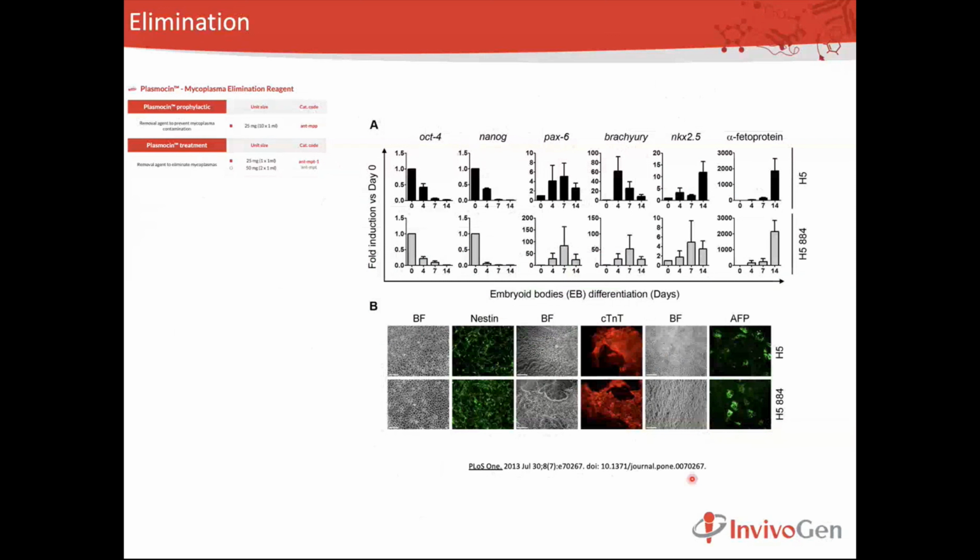Next, they put the test to a next step. Since it is stem cells, they want to see after treatment whether it will affect the stem cell differentiation.